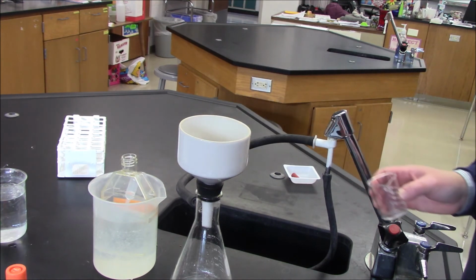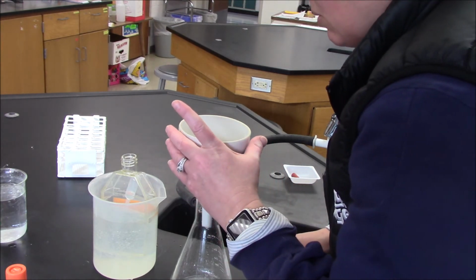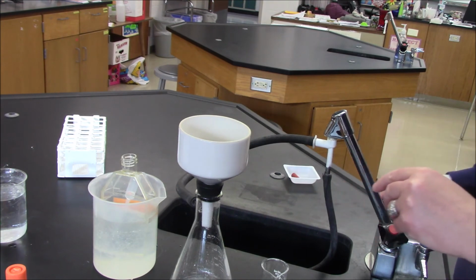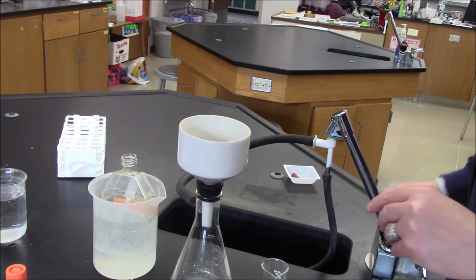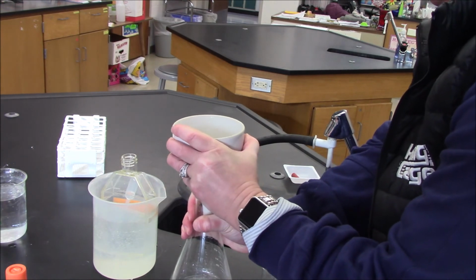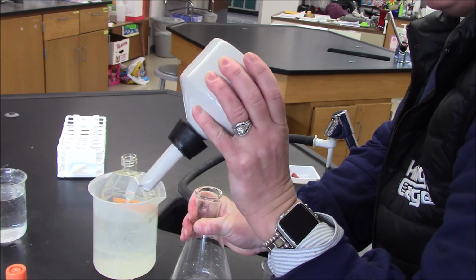I also wonder if the problem is that I did not let it crystallize long enough, even though it was white. Maybe it's not fully solid. Because as I do this again, and even though I'm doing it more carefully, I don't know if "more carefully" is even a word.